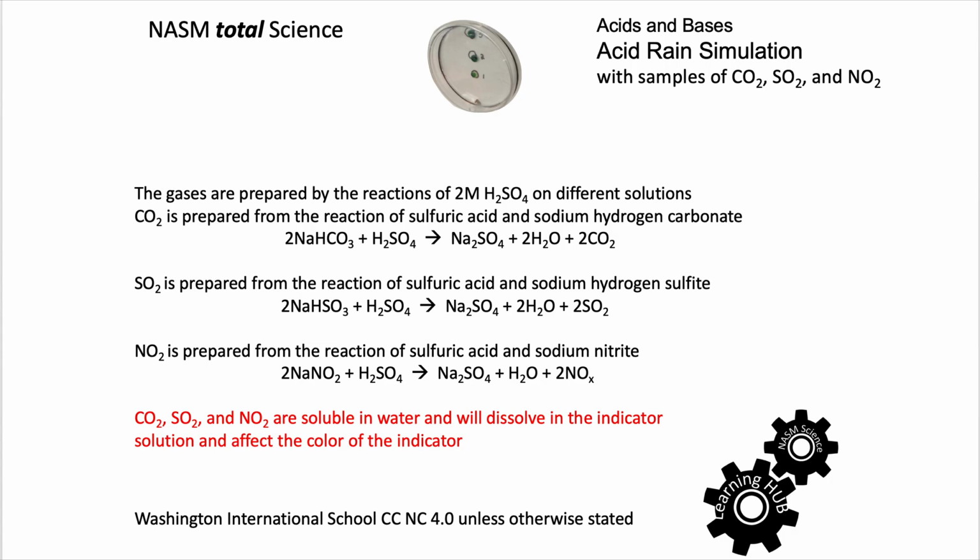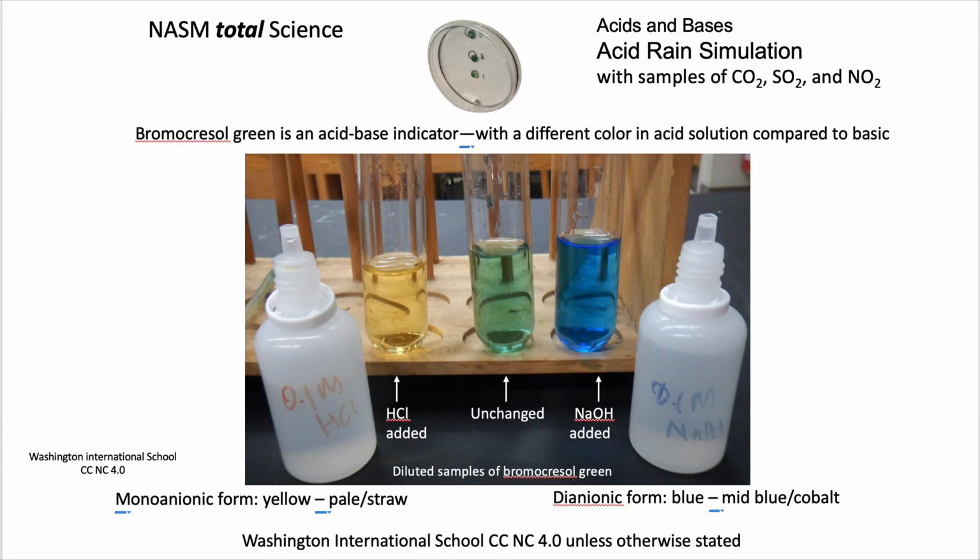You can pause this one to see how the gases are being prepared. But in each of them, 2 molar sulfuric acid is going to react with different solutions: sodium hydrogen carbonate, sodium hydrogen sulfite, and sodium nitrite. And they are all water soluble.